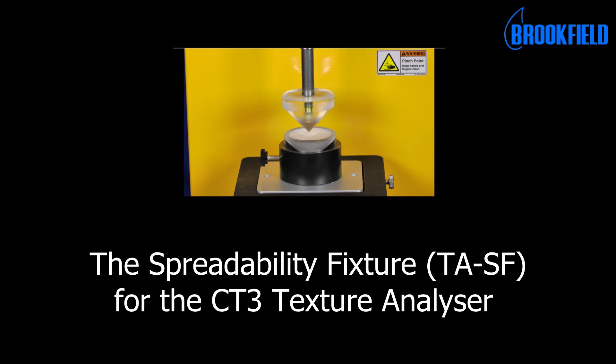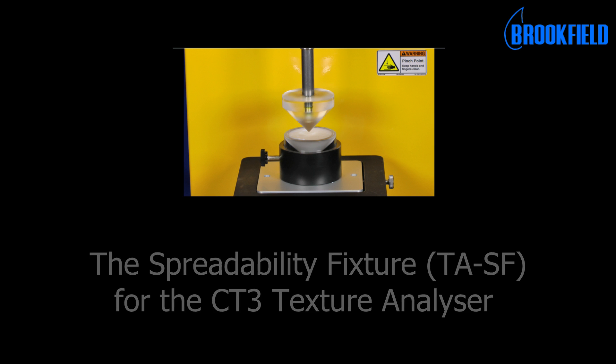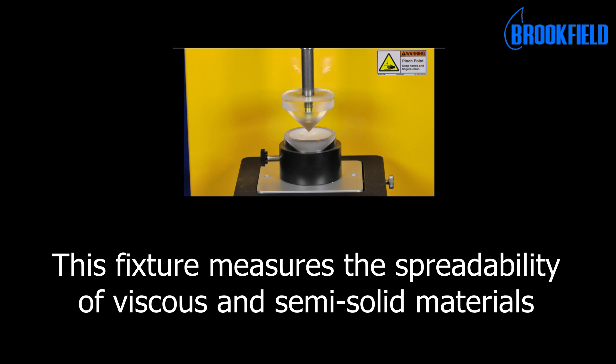This is the spreadability fixture for the CT3 Texture Analyzer. This fixture measures the spreadability of viscous and semi-solid materials.